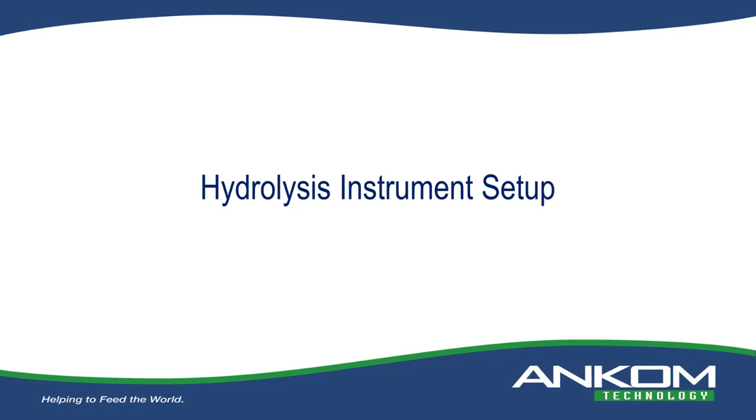We welcome you to the hydrolysis webinar, and we will be discussing not only the instrument setup as you can see on your screen there, but also setting up samples and putting them through.